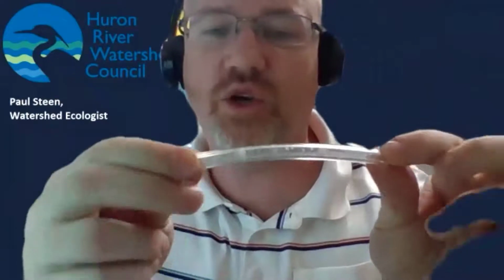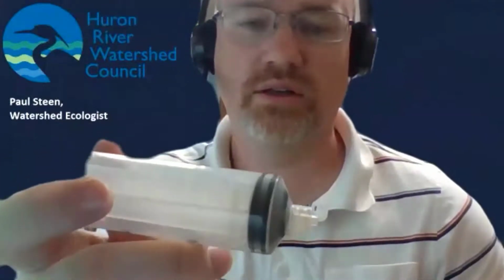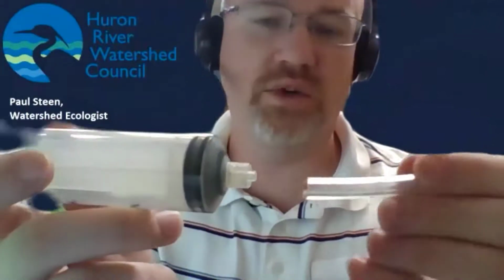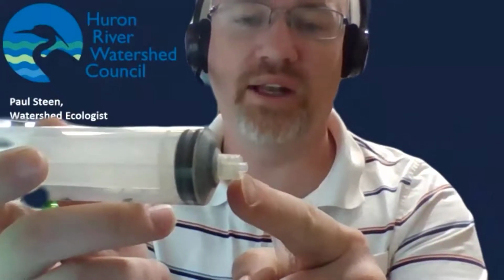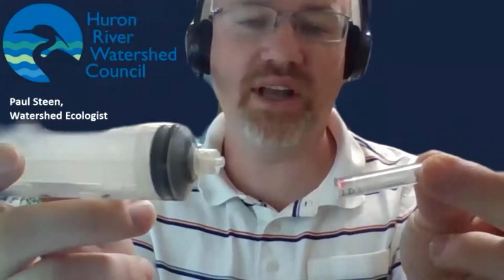We also have this, called the Tigon Tube. What you do with this is you take your syringe and the tube goes in there. Now the syringe will have these threads in it. The tube does not have threads.